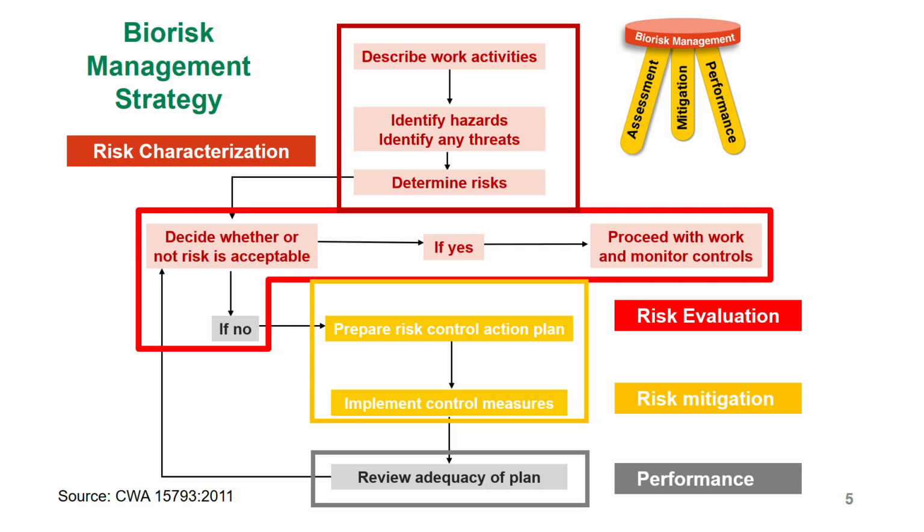Then after you implement them, you come back after maybe a few months and check, are these control measures that we've now implemented working or not? So you check performance again. As you're checking performance, check practices as well, so that you rule out the human factor for these control measures.